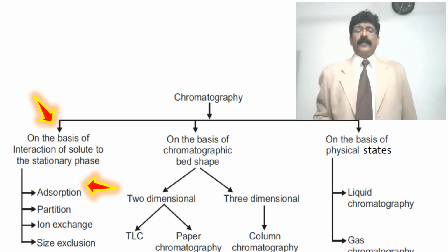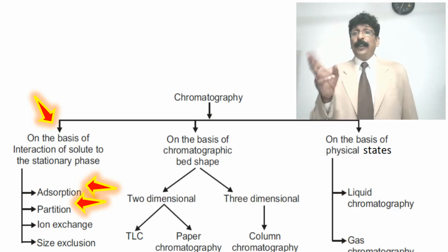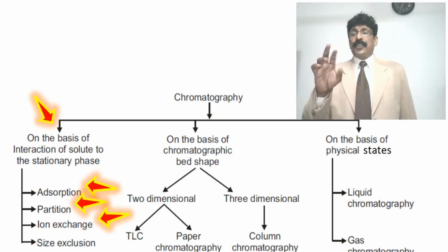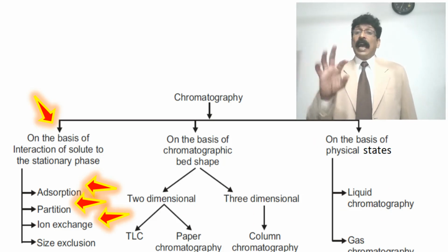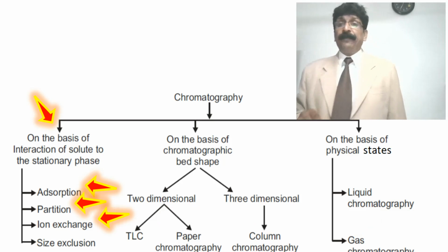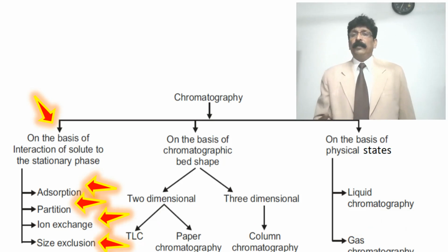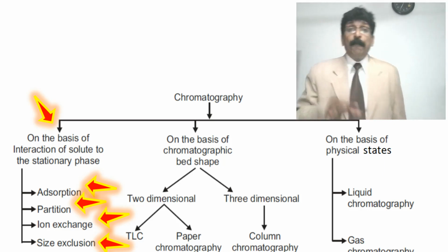Partition chromatography, between two immiscible liquids. Ion exchange, cation and anion exchange chromatography. Size exclusion, gel permeation chromatography, by means of molecular size.